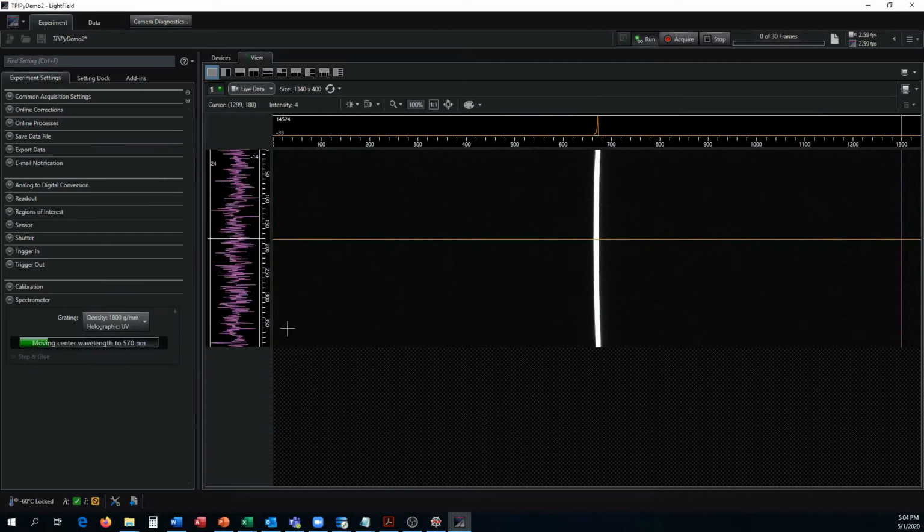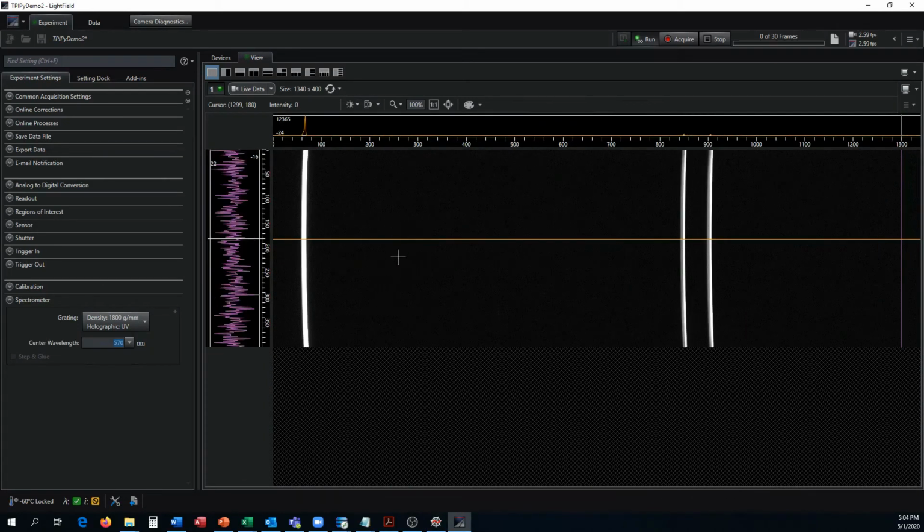Sorry. So you can see it's going to do another motion thing, and now we're going to get a strong peak on the left side with two smaller peaks. So this is the 546 strong peak. This is the 576, 579 doublet. So we're gonna get that.